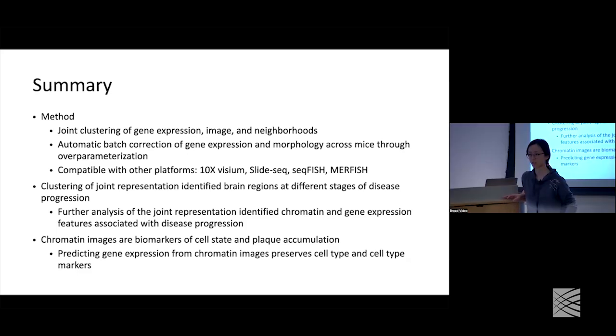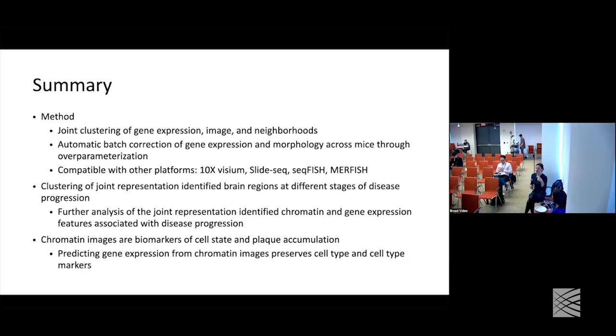We're not actually using single cell data here. It's just the spatial data. So I guess if you were to integrate in the future, the number of genes that you consider is somewhat limited by the number of probes you can do, right? I was imagining a future where you might use the higher dimensionality of single nuclei data to enhance some of your correlation. Have you thought of doing that, or is it just too difficult given the dimension of data from the spatial transcriptome?